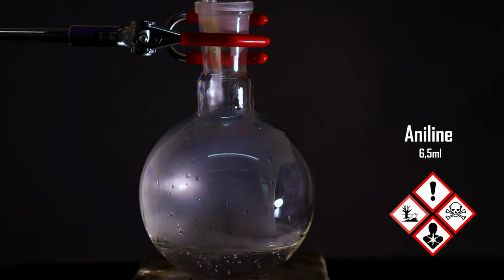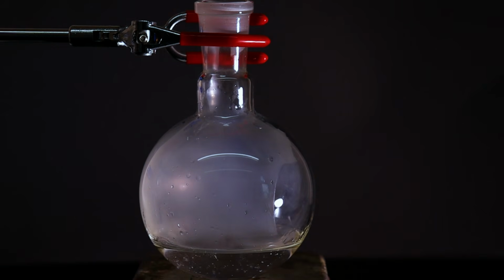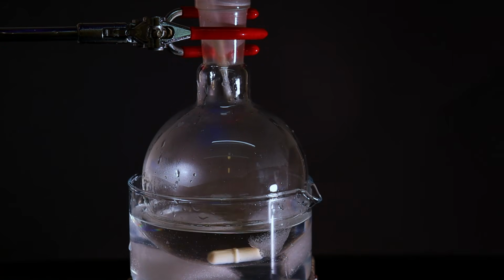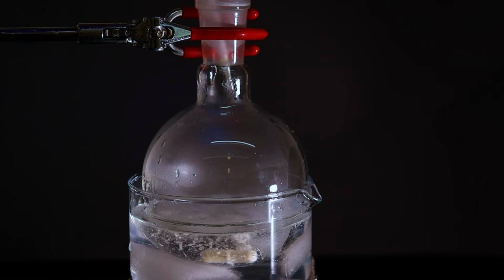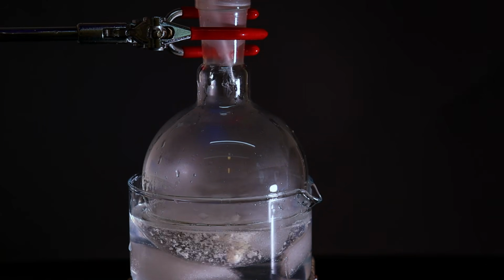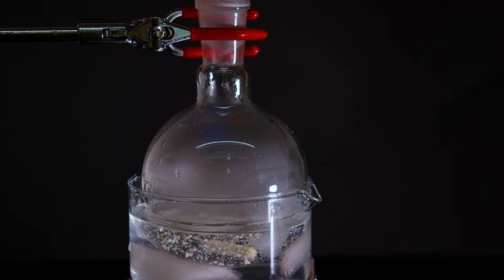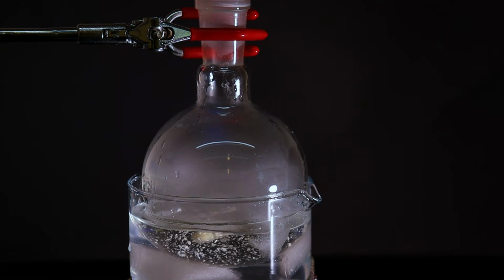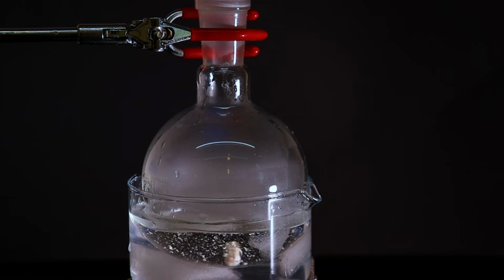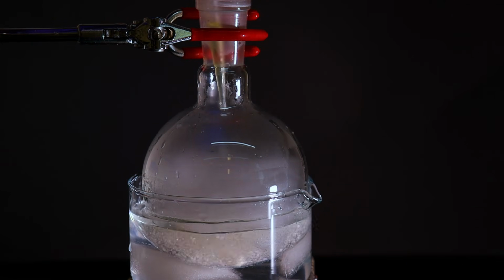As you can see, immediately upon addition, a visible reaction takes place and some white smoke forms. This is just some aniline hydrochloride, and it is the product of this simple neutralization reaction. Besides, it also produces quite a bit of heat, and therefore I placed the flask in an ice bath. I will explain why this is important in just a bit. Now I need to add all of the aniline into the flask, and then we can proceed with the next step.